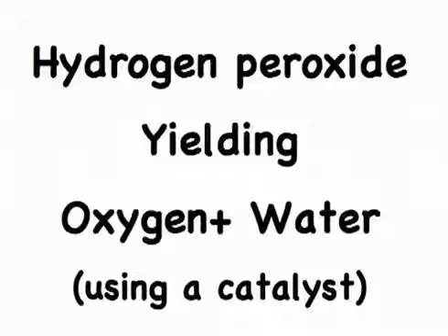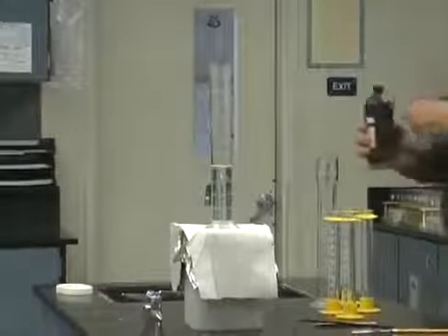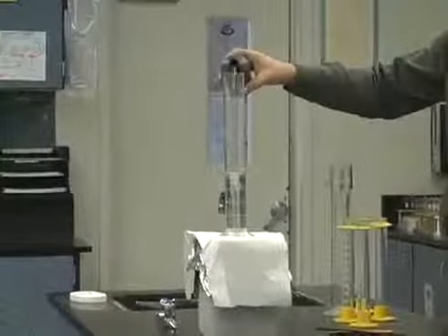Let's break down hydrogen peroxide into oxygen and water. Get a little bit of water, but this is the hydrogen peroxide. I've got hydrogen peroxide. Grandmother's hydrogen peroxide, we got it souped up a little bit. But it basically is a clear aqueous solution.